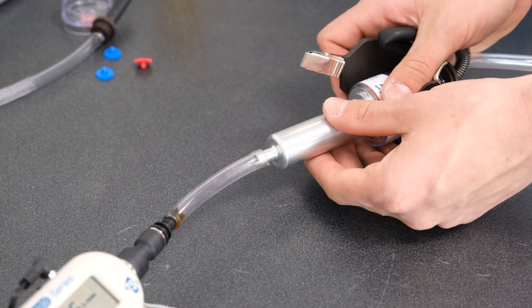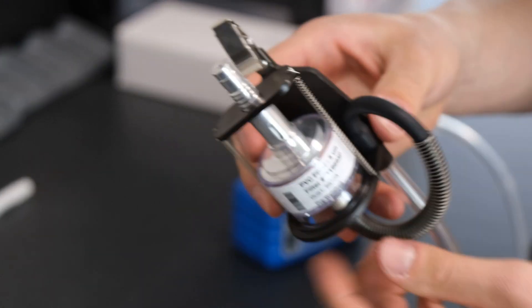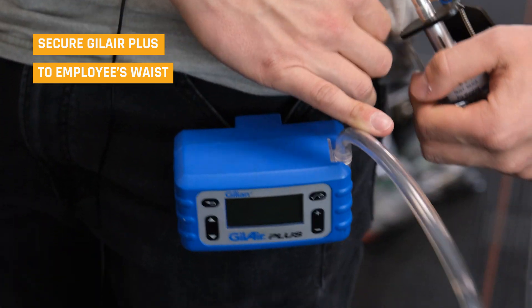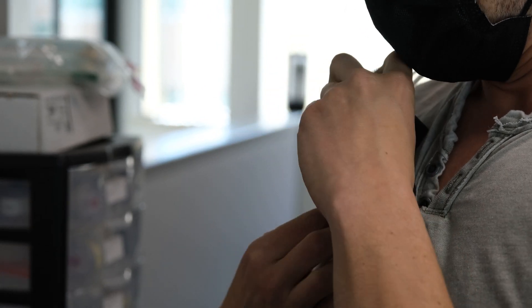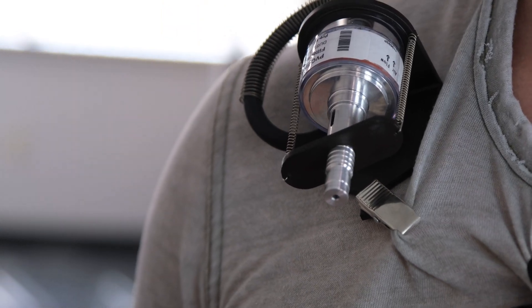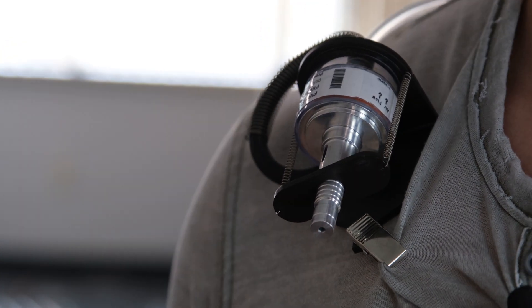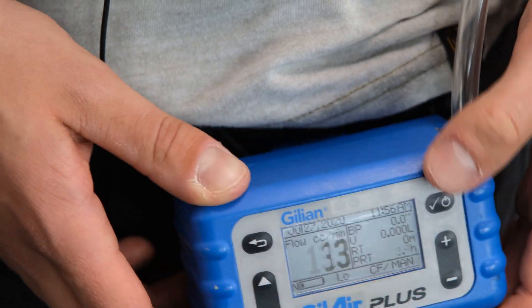Now that we're done with our calibration setup, we're going to pop this off and throw this over the top — now we're all hooked up and good to go. We're going to look to put it on our employee's waist or belt buckle. It's just going to sit right on their shoulder in their breathing zone — very important for your personal exposures. The employee is then free to go about their specific tasks, whether developing a STEL, getting your eight-hour time-weighted average, or whatever we're looking to sample. Make sure to turn on the pump, click run, and there we go.